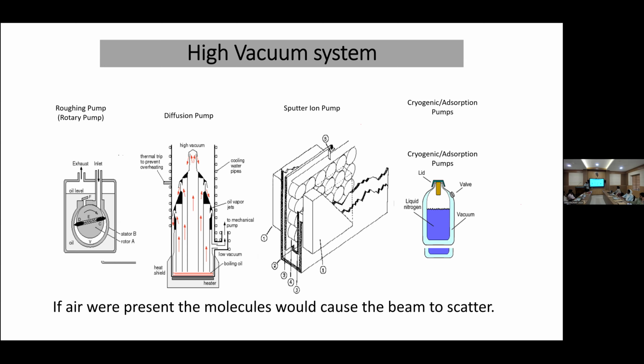Here we have oil, heat it up. Then here is our column. So the vapor jet comes through this portion, and because of this flow, from the low concentration, where maybe some air or some dust particle is there, to the more concentrated area in the column, it will flow to this region, and our mechanical pump pumps this out.